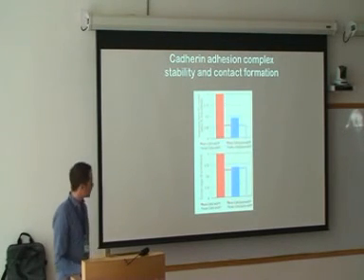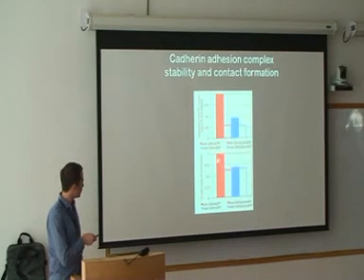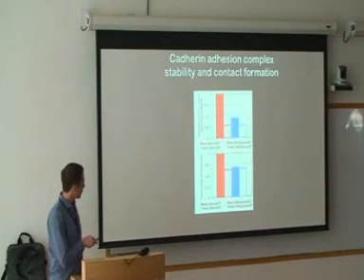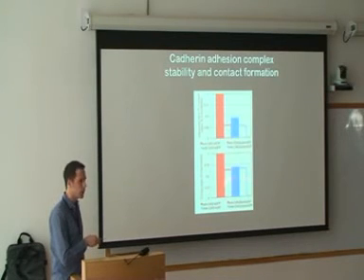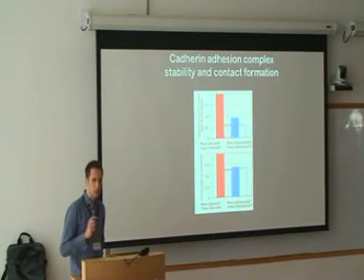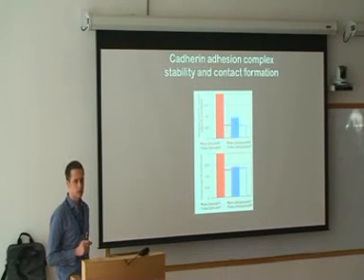Okay, so when we do these experiments, what is happening is, usually if we are expressing a full-length cadherin, and just look here at the contact angle, the contact size. If you're expressing a full-length cadherin in ectoderm progenitor cells, then the ectoderm contacts are larger than when expressing a full-length cadherin in endoderm progenitor cells. That's consistent with the endogenous function. If instead we are expressing a truncated version of cadherin which is not able to bind to the cortical cytoskeleton, the contact shrinks considerably in ectoderm progenitor cells, and it has a similar small size to what you see in endoderm progenitor cells. And that's actually an important experiment because it tells you that the differences in contact size critically depend on differences in the mechanical coupling function of cadherins in these different progenitor cell types.